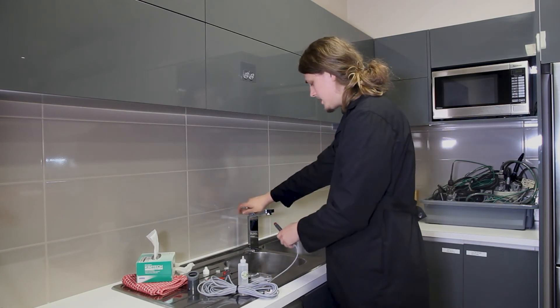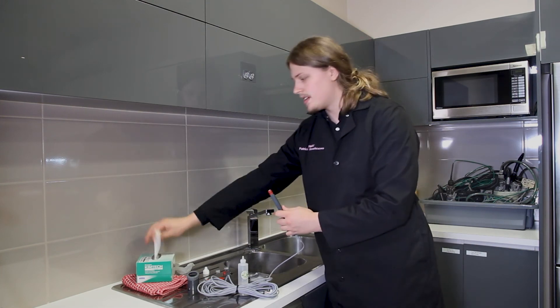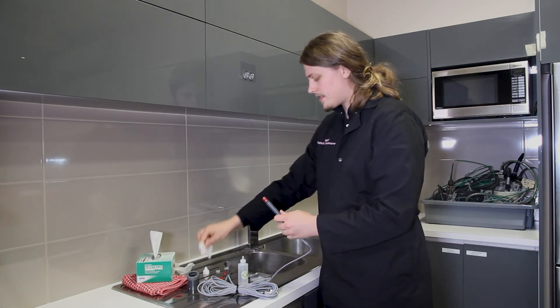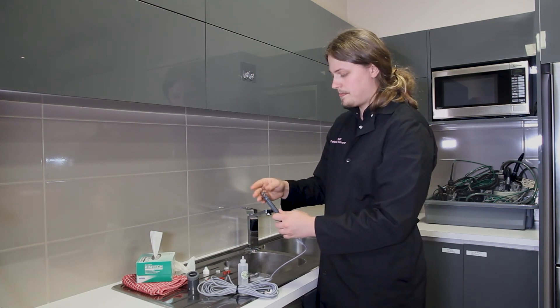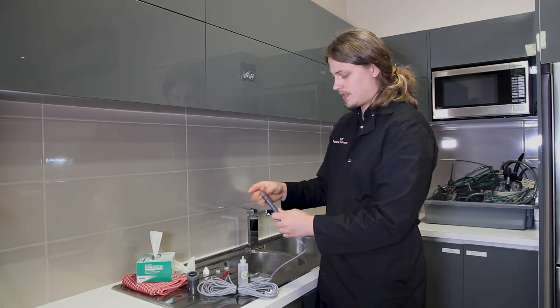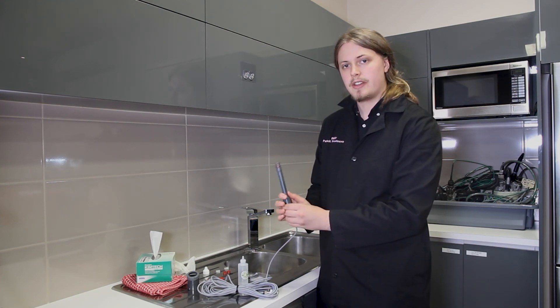Finally, give your sensor tip a wash under water, dry it off, and screw on the sensor cap. And there you go—that's how you replace the membrane on a DO sensor.